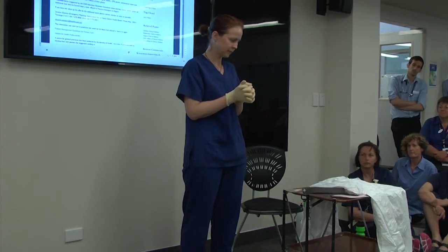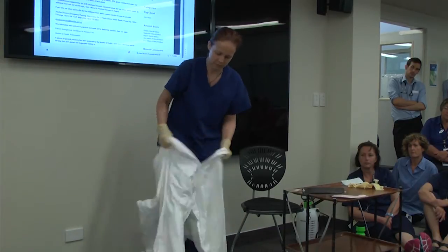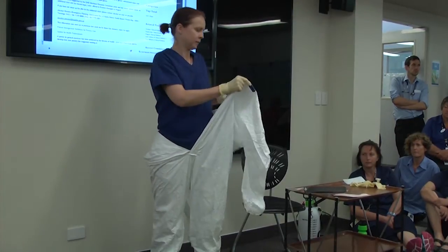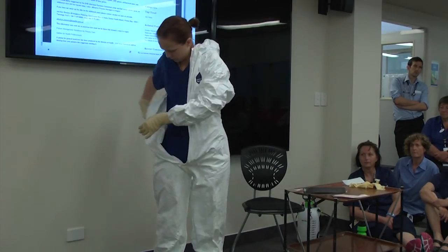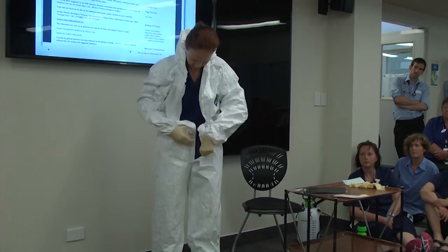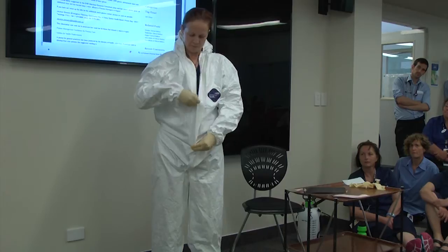The next step is to put on your coveralls. You'll step into your coveralls, then put your arms in. You can zip partway — you can zip them down there. That little protective flap is easy to catch.